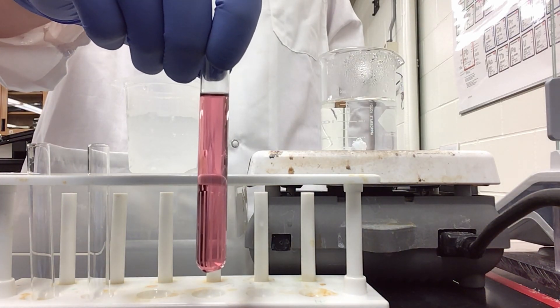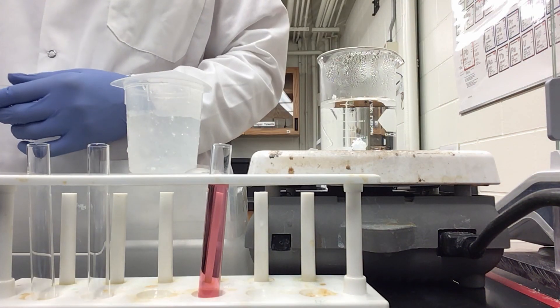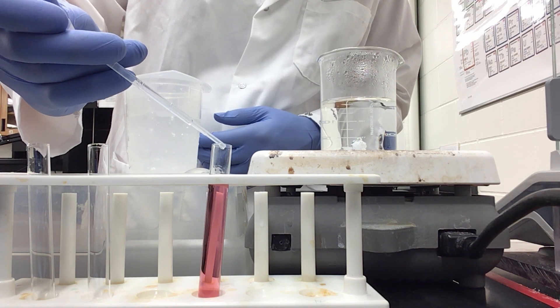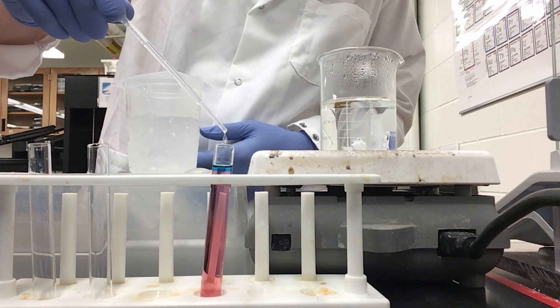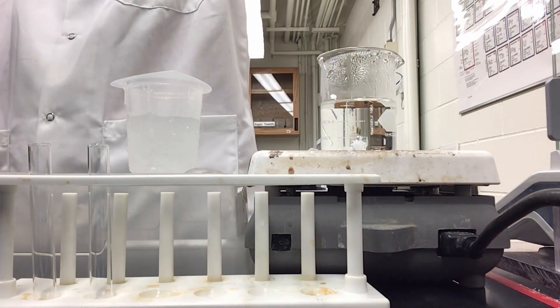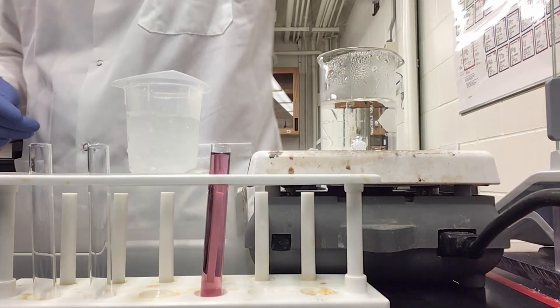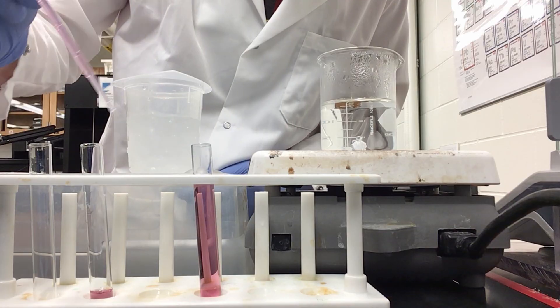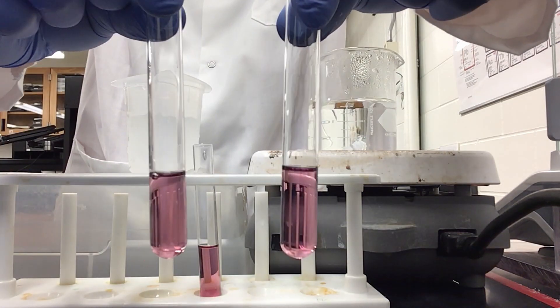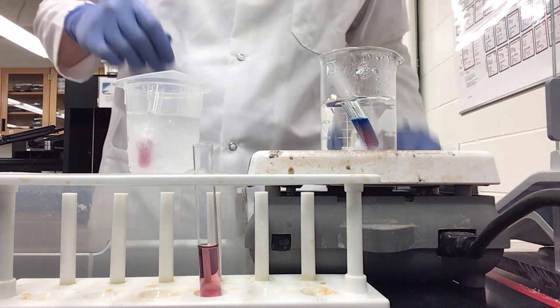Here I have a solution that is 8 milliliters of the hexa-aqua cobalt cation. I am now going to be adding calcium chloride dropwise until my solution is a violet or purple color. The solution has darkened slightly from pink to more of a purple. I am going to be taking 8 milliliters of this mixture and dividing it into two test tubes — one into my hot water bath, the other into an ice bath.